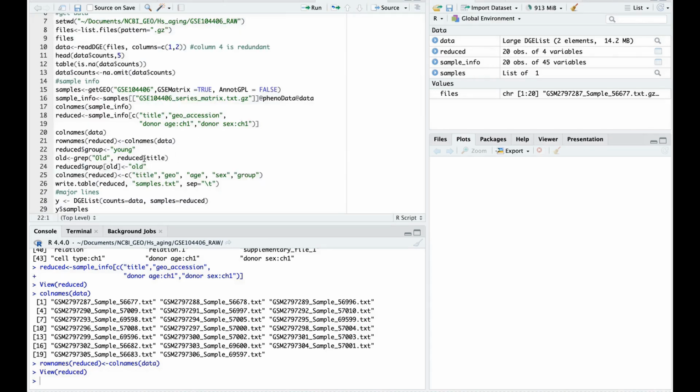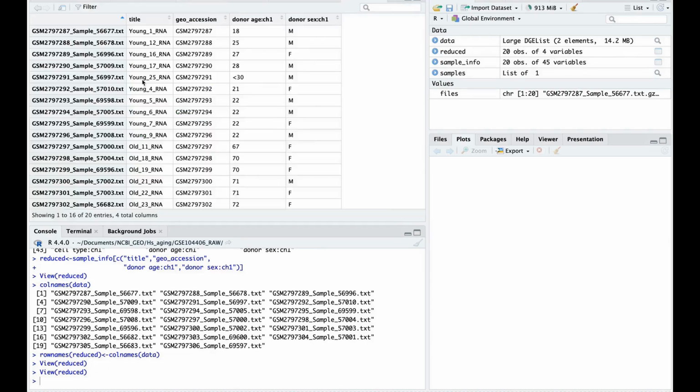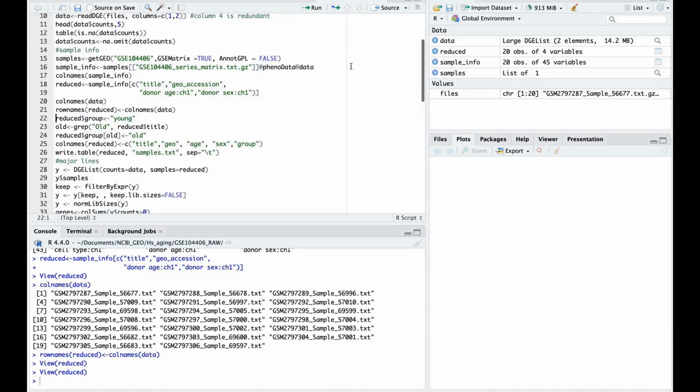Then you generate young and old group, because again ages are not converted into groups. They are over here, so young and old should be extracted, or this should be used, which was not used. But this column is also not usable immediately because of this. Alright, we continue.